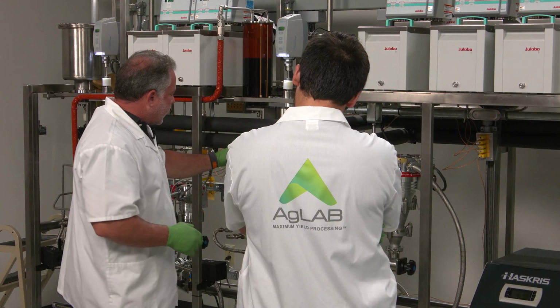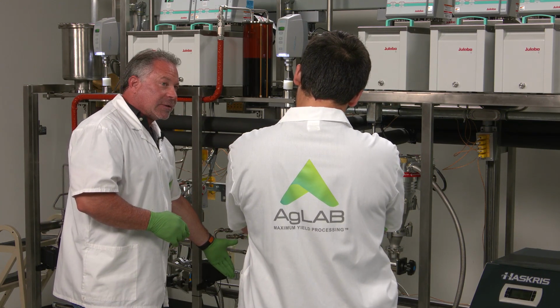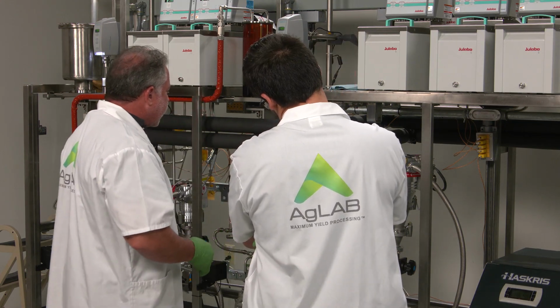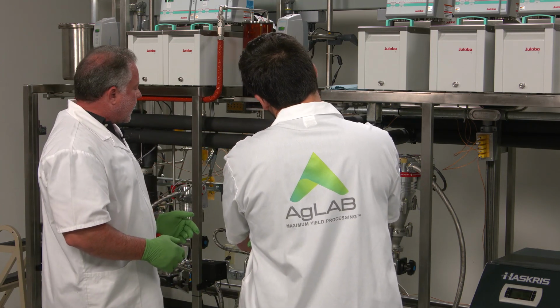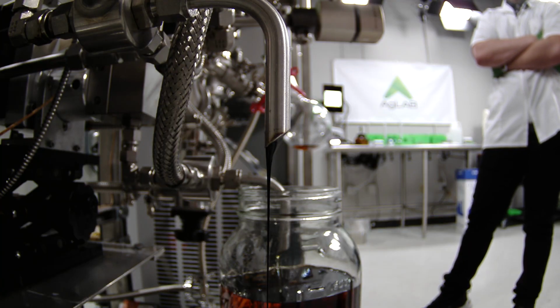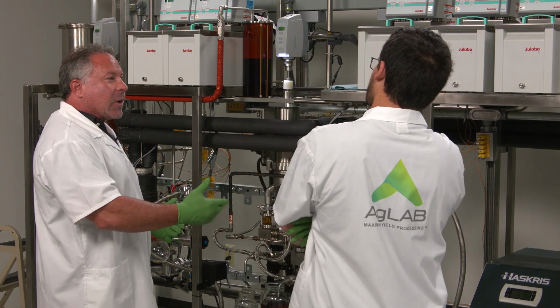So now we have our residue feed. There's 23% cannabinoids in there, and our distillate side over here is the remainder. One of the things we're looking to do too, with our condenser temperature, is look at how good the color is coming out. It's a metric that we use in the industry to look at how good the quality is of what color we have.